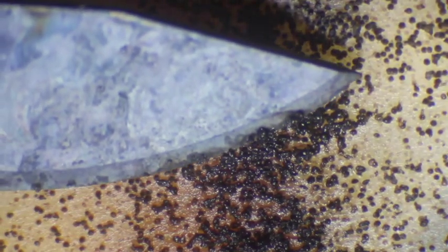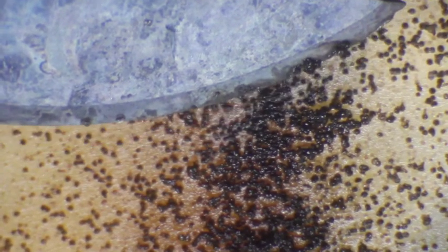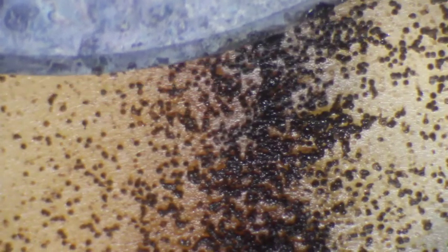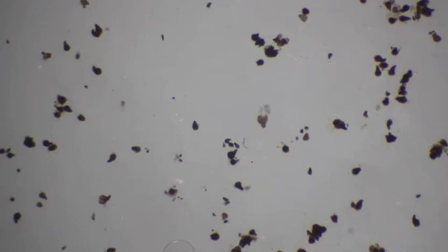And if we look very carefully, I can focus in on that. So I can see all the little teeny tiny perithecia on the end of that scalpel blade. So here are all of our little mushroom guys in there. Each one of those little black dots is one of the mushrooms that we have in there.